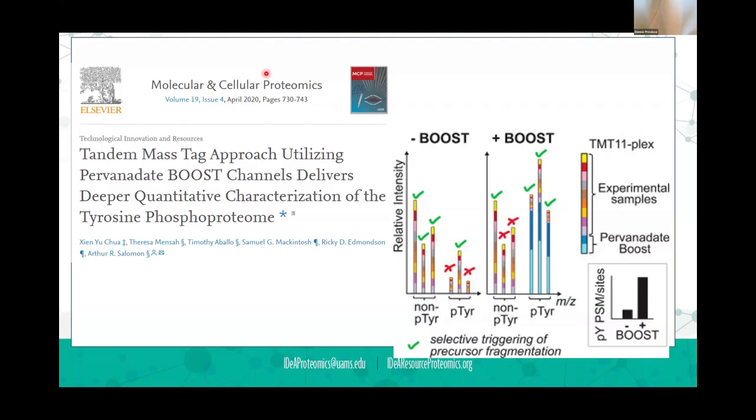And it's shown here in this MCP paper. Sam McIntosh and I helped them develop the method, and they were nice enough to include us on the paper. But it is a nice way of enriching for phosphotyrosine. We keep saying this may be something that we add, and at some point we likely will, to grow up the super binder in our lab and use it as a way to enrich phosphotyrosine just because of cost. Because it's so much more cost effective.